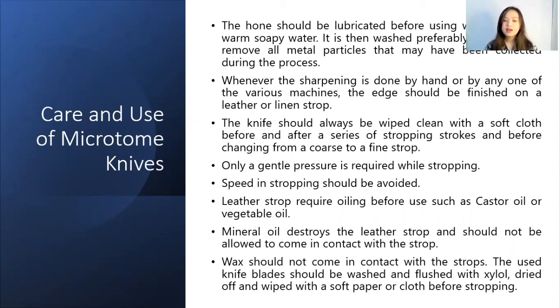And the eighth, only a gentle pressure is required while stropping the knife. And speed in stropping should be avoided. So 1 full second should be allowed for each stroke to avoid injury to the strop and the knife. And the leather strop requires oiling before use, such as castor oil or vegetable oil.